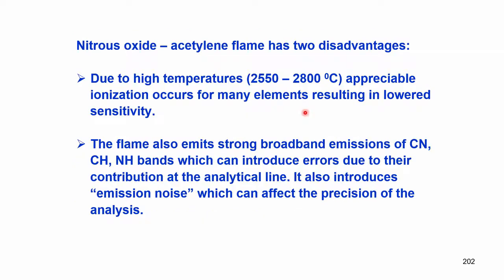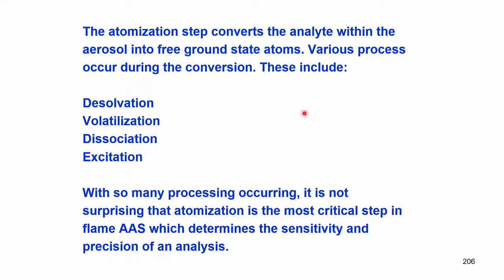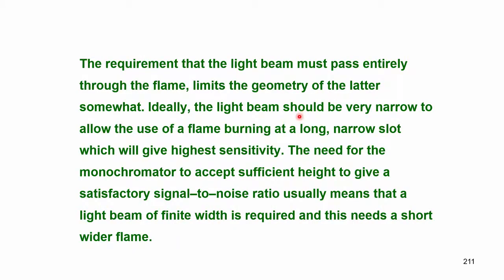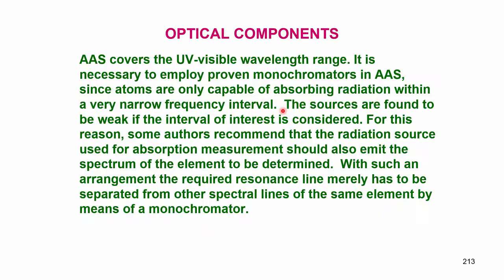Now, I want you to understand that optical components are part and parcel of any spectrometer.